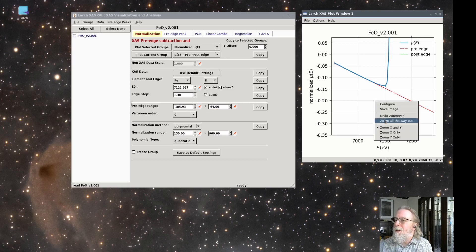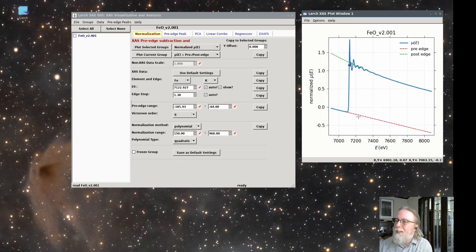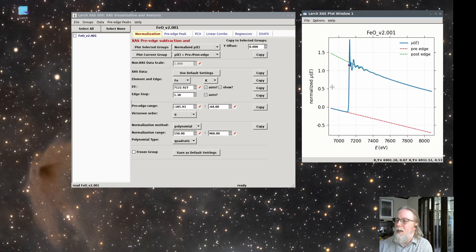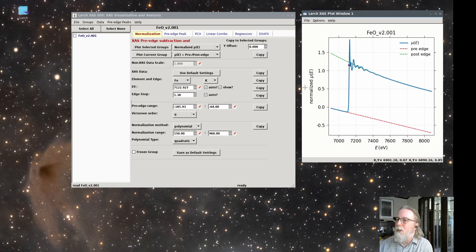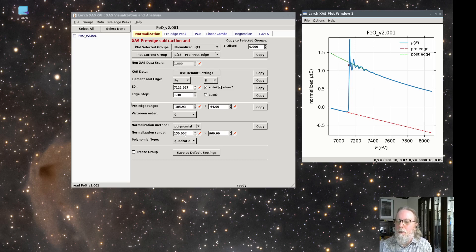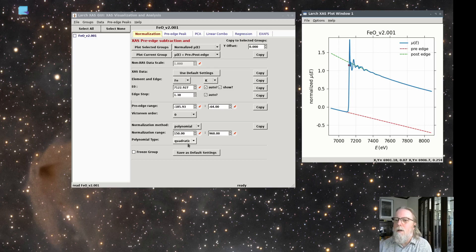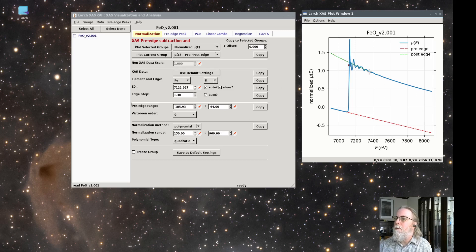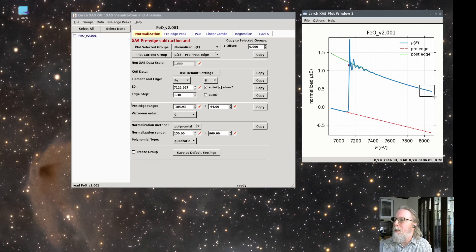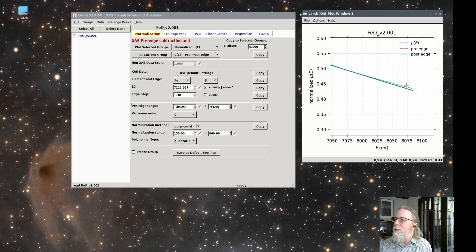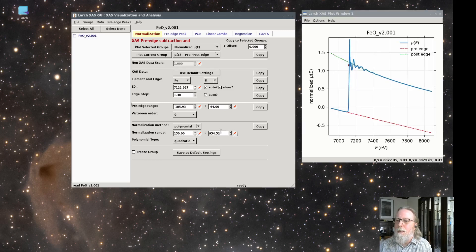So it's fit a line there and in the post edge, it's fit a curve. Here it says it's going to use a polynomial that will fit from 150 EV above the edge to 960. So it's fit this curve and it's a quadratic polynomial. So you could, the 960 must be the last energy point.